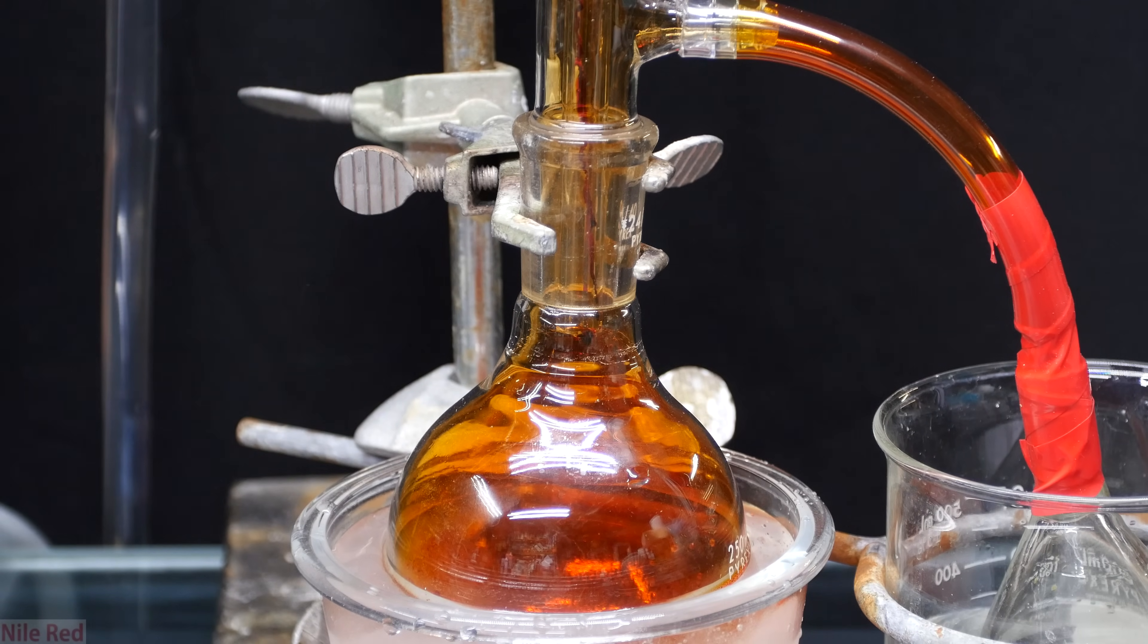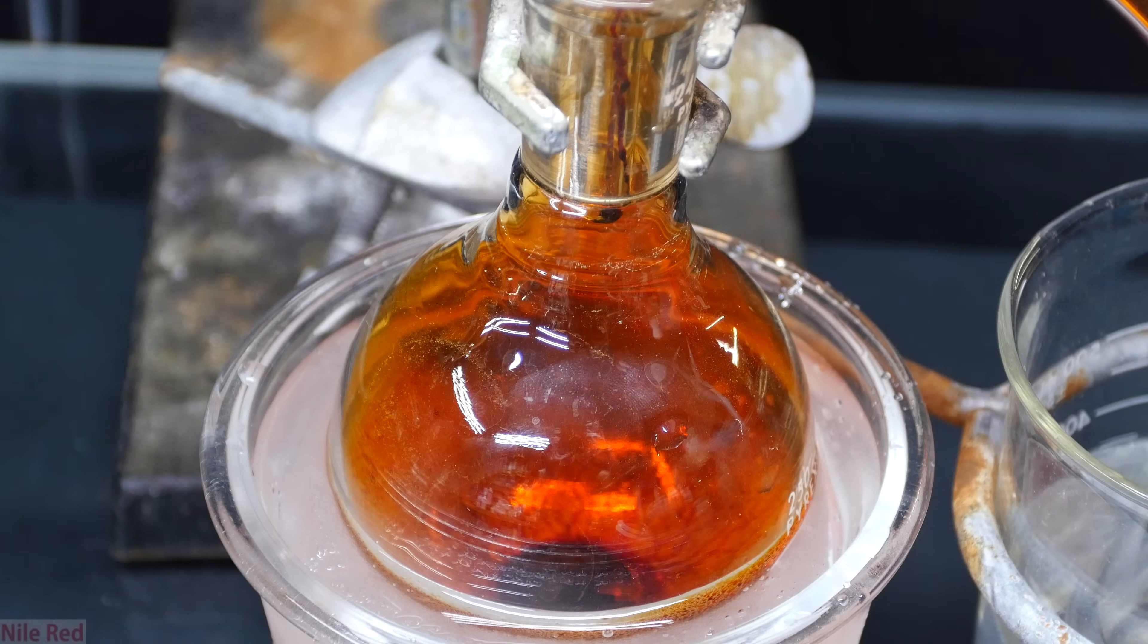Eventually, some very nice, nearly black drops of bromine will start to come over. At the bottom of the receiving flask, we can see the black, dark bromine liquid starting to build up.